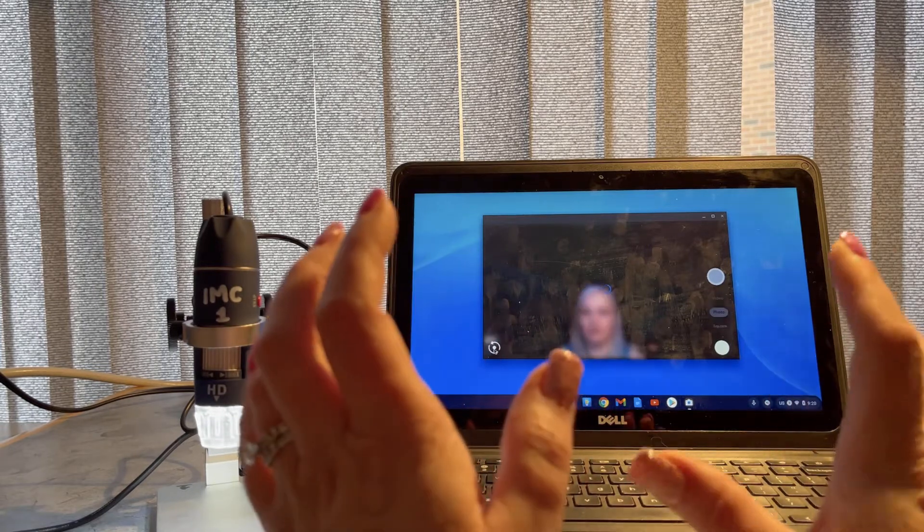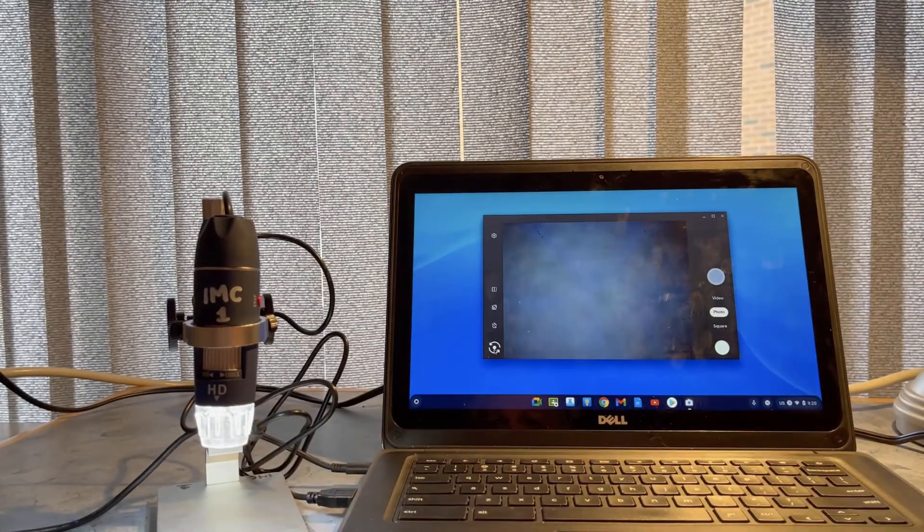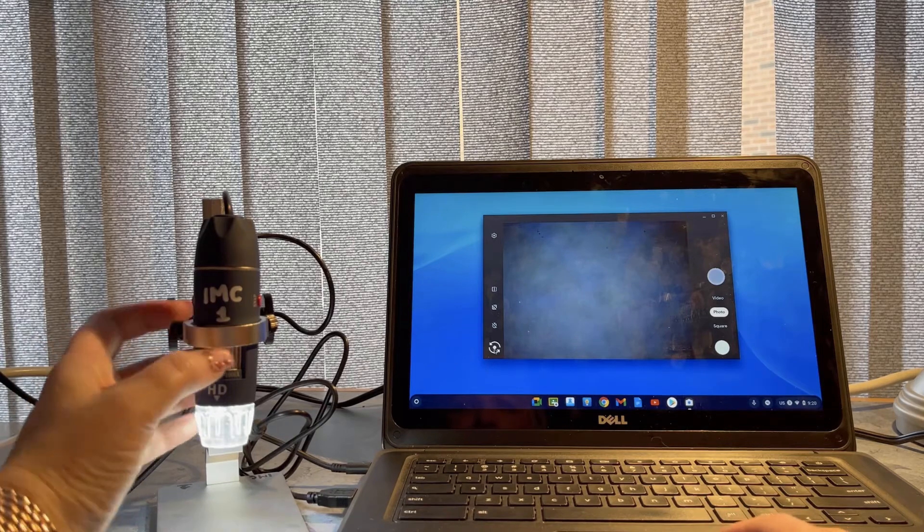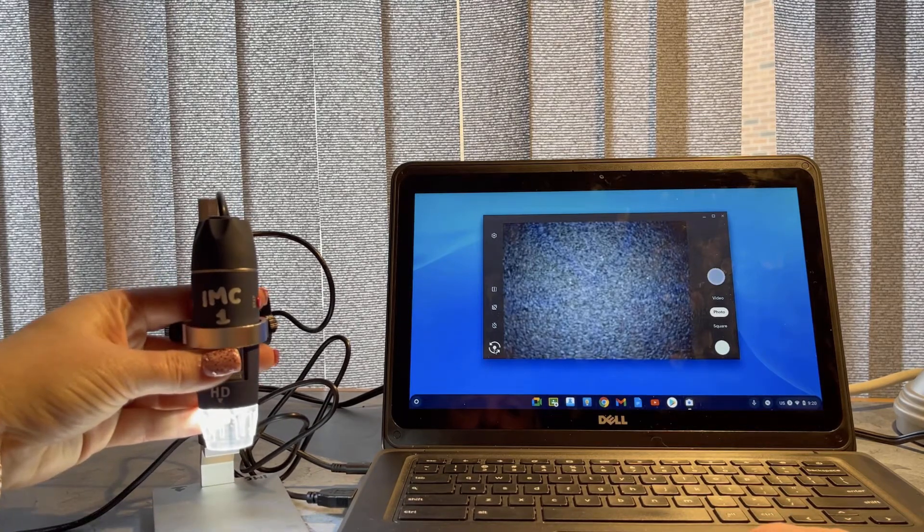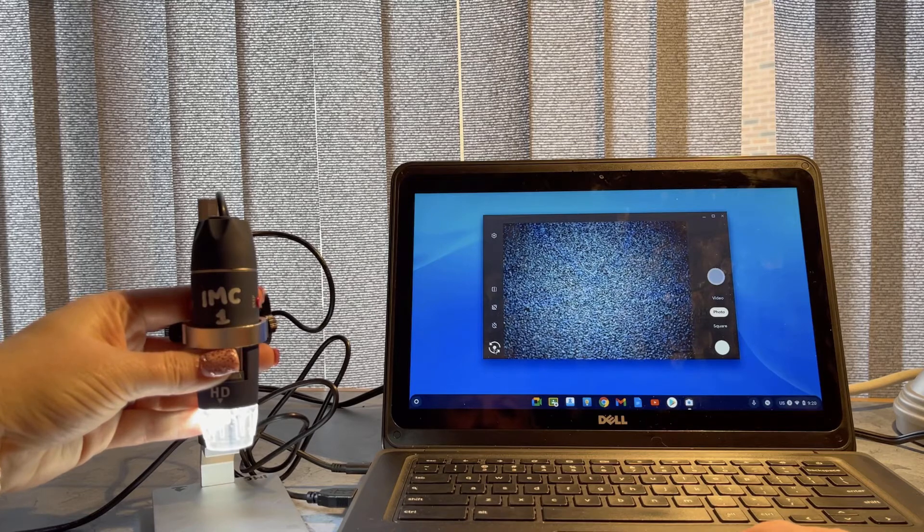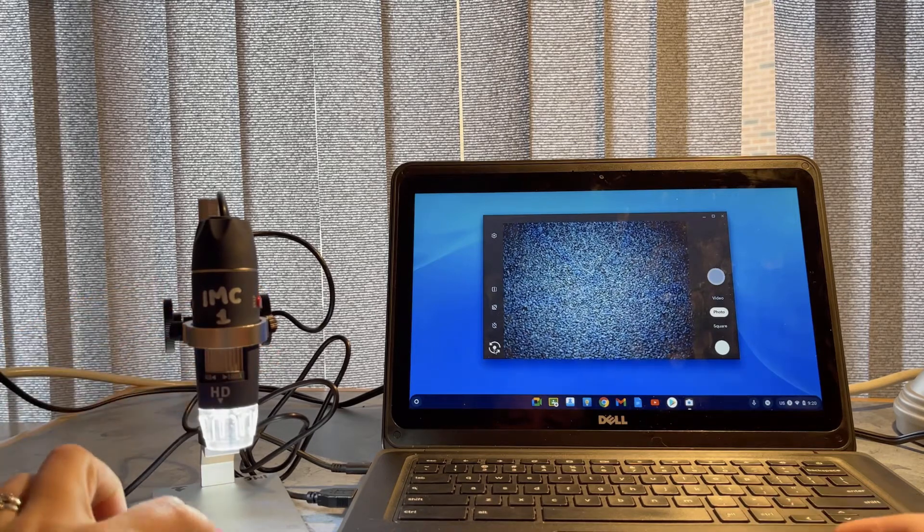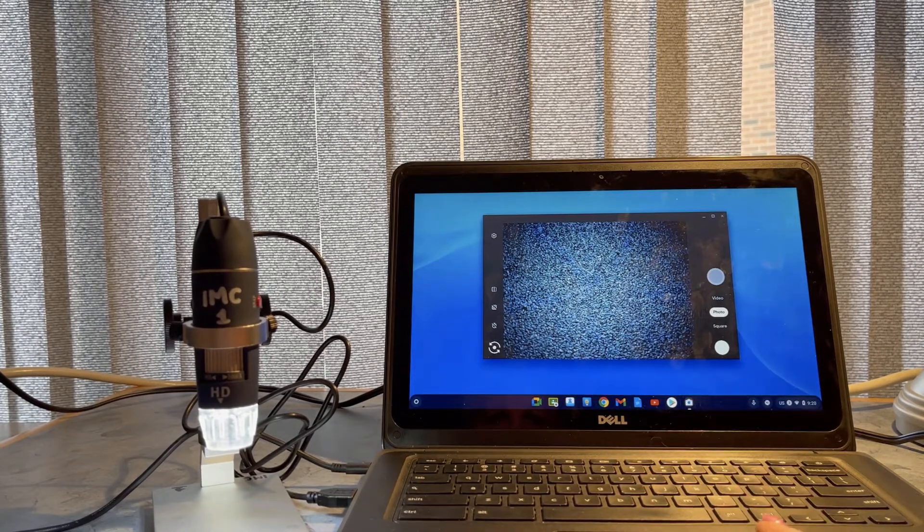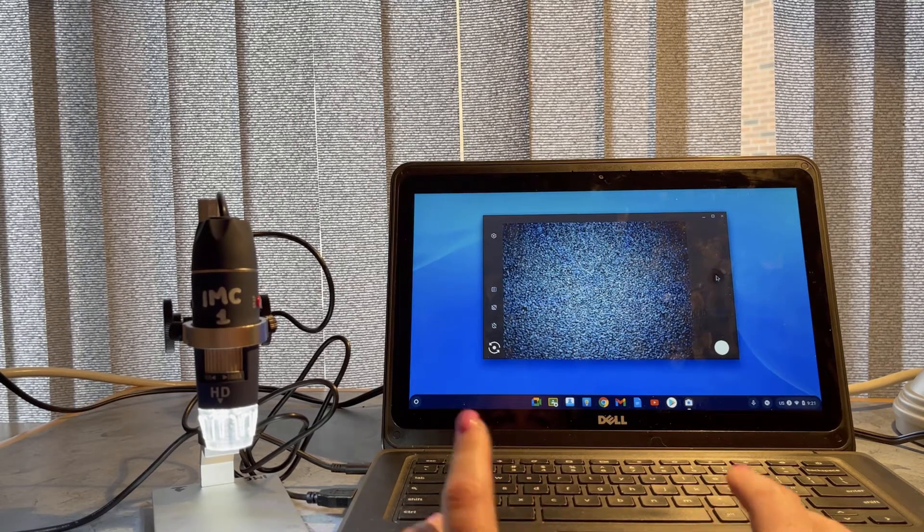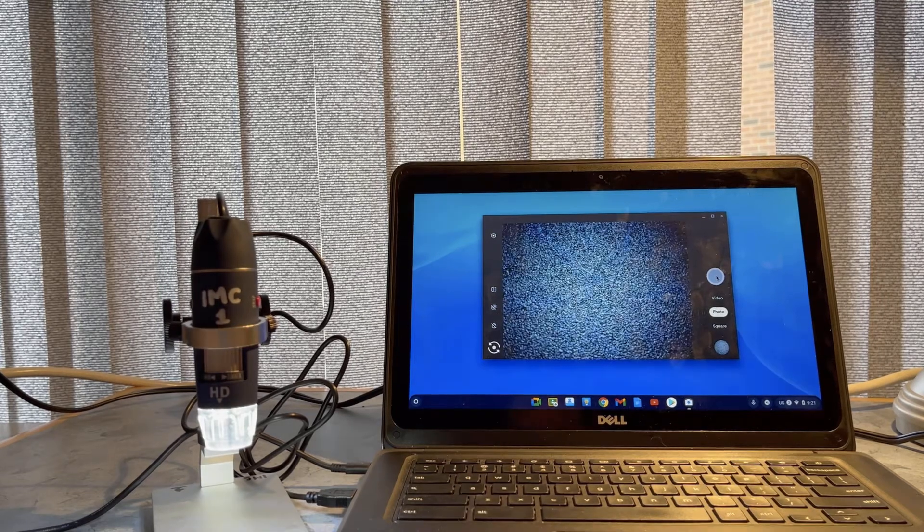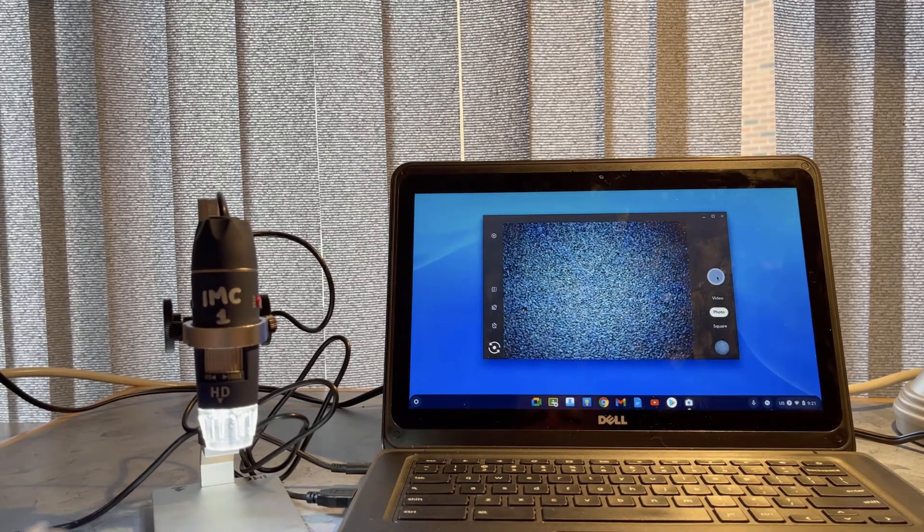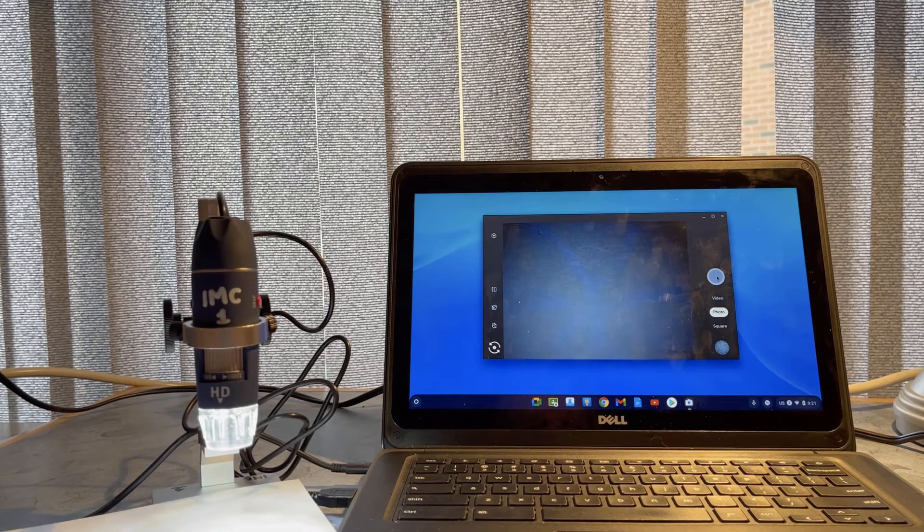If I click on that, it's going to switch the camera. Now I'm seeing what's in the microscope's view. If I start to do the focusing, the microscope is tuned in on the base of the microscope. If I want to take a picture of what I'm seeing, I can hit 'Take Photo.' Personally, I don't care for the metal surface, so I would put a piece of white paper down before getting too serious with it.